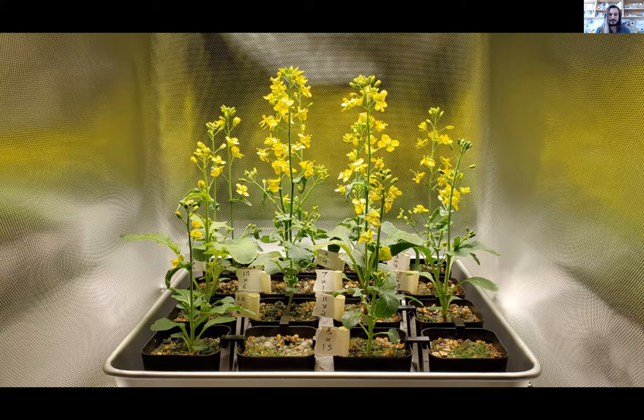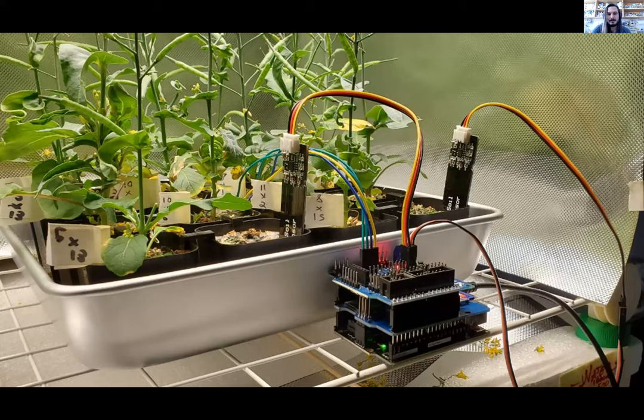But in order to replicate some parts of this growth chamber, I decided to automate the process. So the first thing I did was try to measure the amount of water, but not by measuring the water level, but by measuring the actual moisture of the soil, right? And there's these really cheap capacitive sensors that essentially read the capacitance that builds up by putting something conductive and wet next to the device, and it gives a signal, an analog signal, which you can then read.